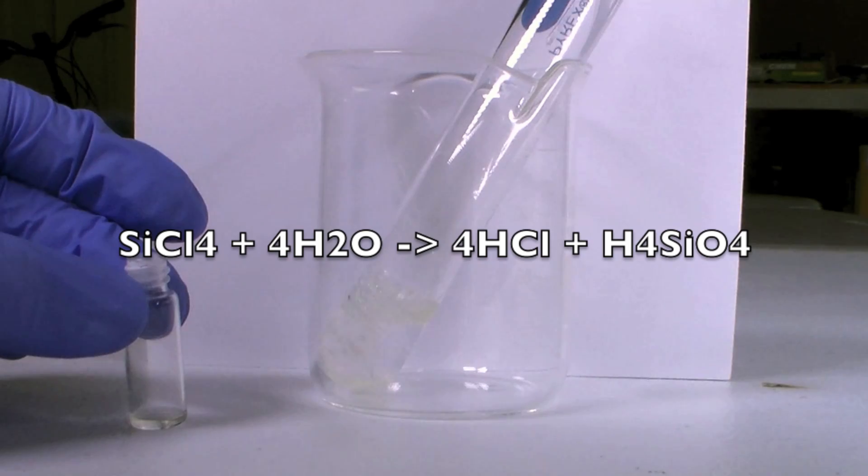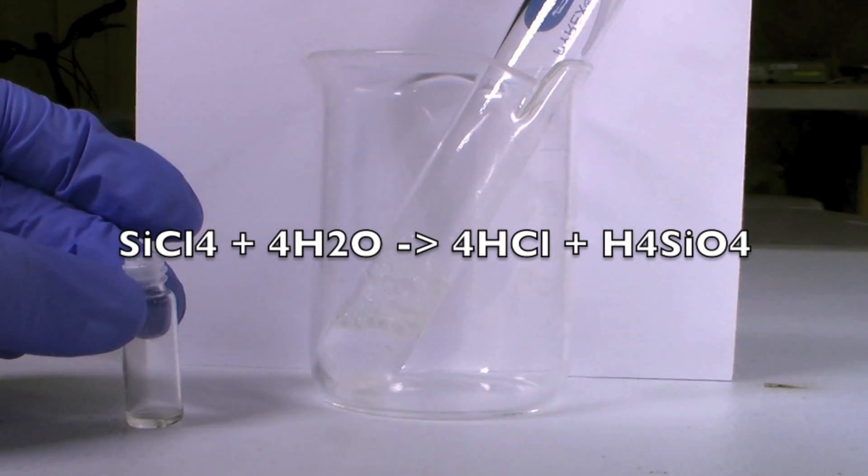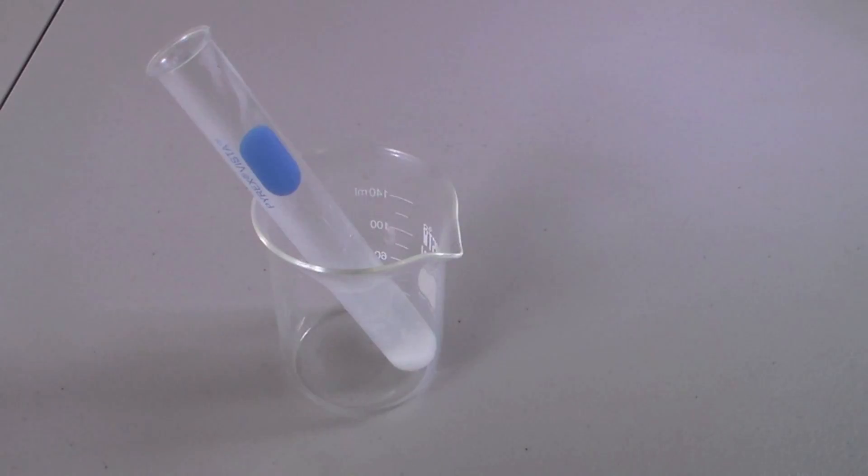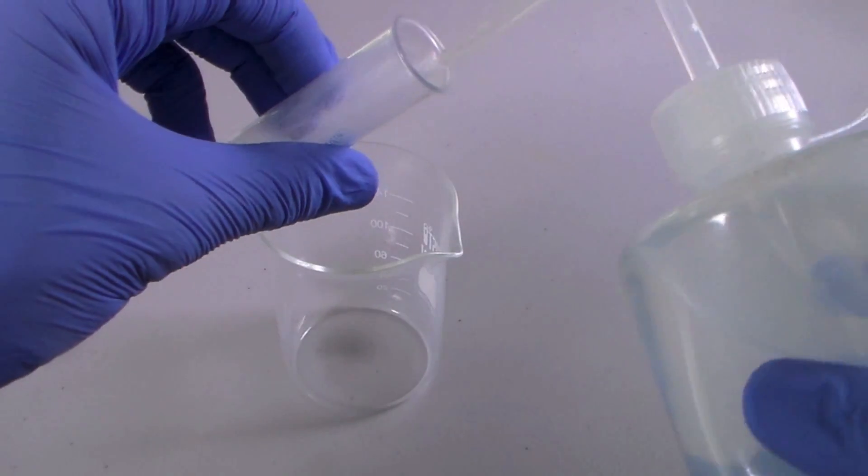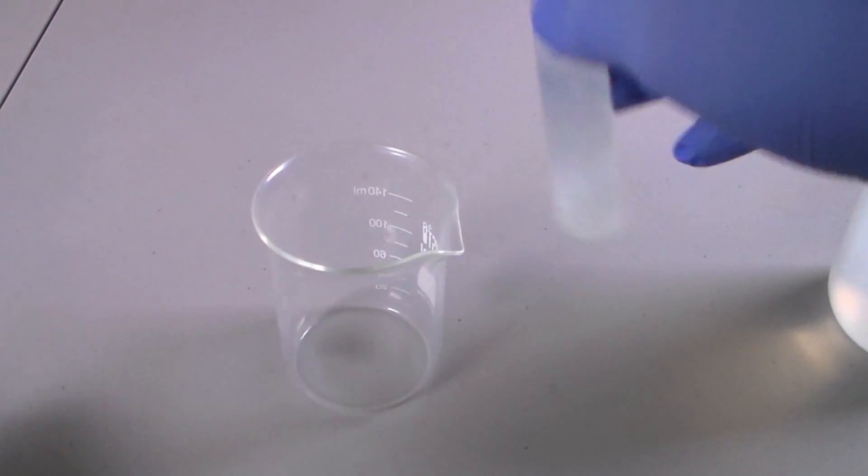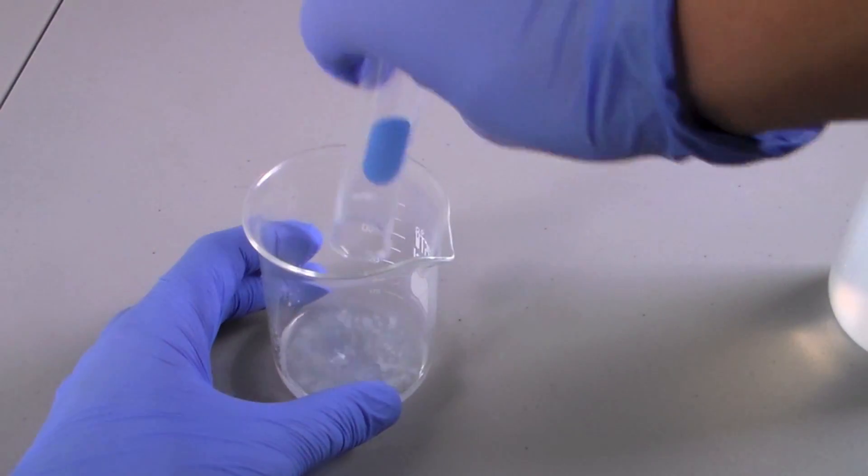The products of this reaction are hydrochloric acid and silicic acid. The silicic acid is the white solid left in the test tube. This can be heated to convert it into silicon dioxide or sand.